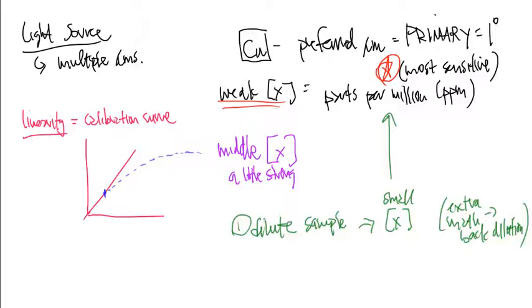So the second choice is to choose a different wavelength. Choose another wavelength. And you know, that doesn't make any sense, does it? That wavelength needs to be nanometer, and that is the symbol for wavelength.